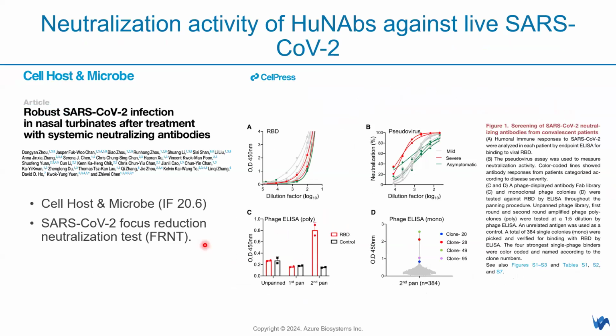of users, which is a microneutralization activity, where they published in Cell Host and Microbe during, I think, the COVID time. So what they call this is focus reduction neutralization test. I am not a vaccine person or a virology person, so I may not be the best person to explain this, but I will let you go through what they actually do. Basically this is for COVID, looking at the best antibody in development, and or looking at the response in that sense, right?